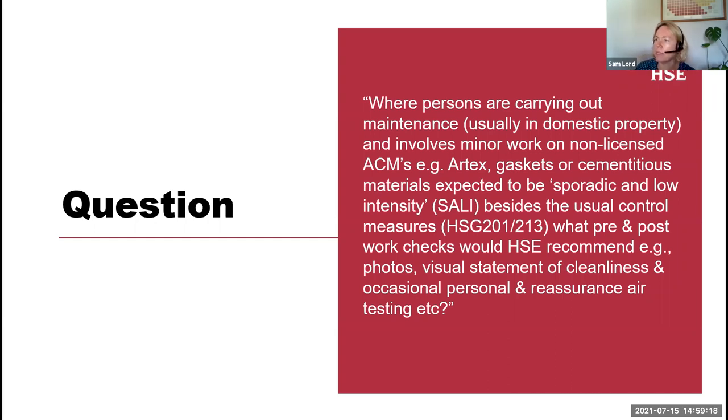Okay, so why have you not increased the volume of air to be collected in personal sampling? I'm not too sure what that actually means. I mean, that guidance table 5.2, that's the minimum recommended levels. It's really to make sure that, certainly for personal sampling for the control limit, it's accounted for the flow rates. So that has been increased.